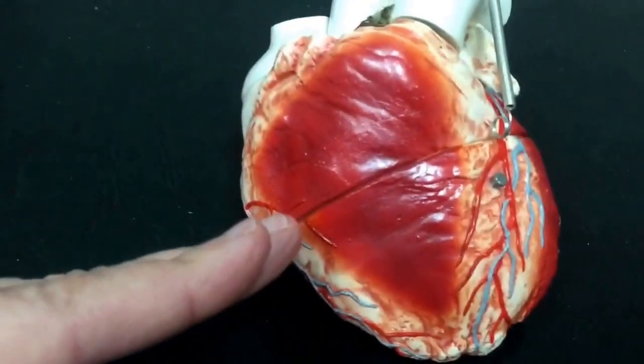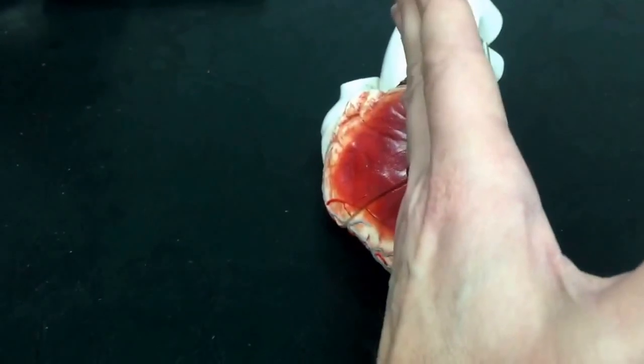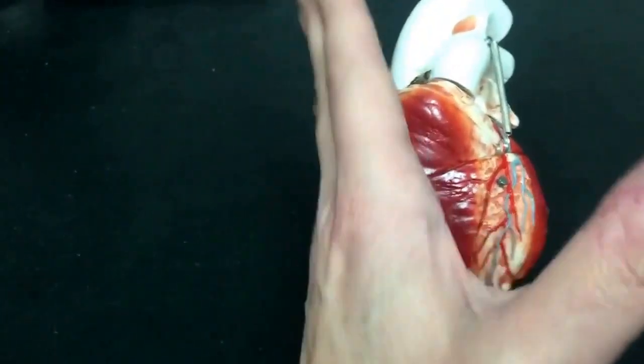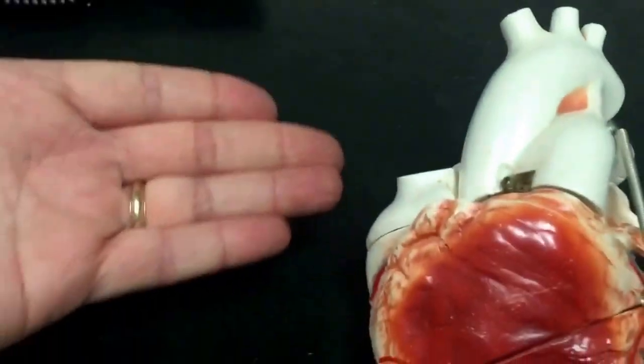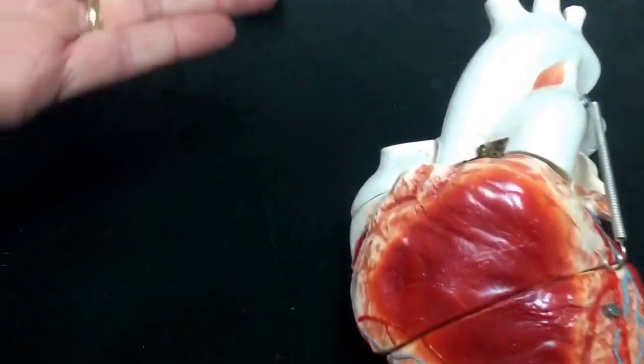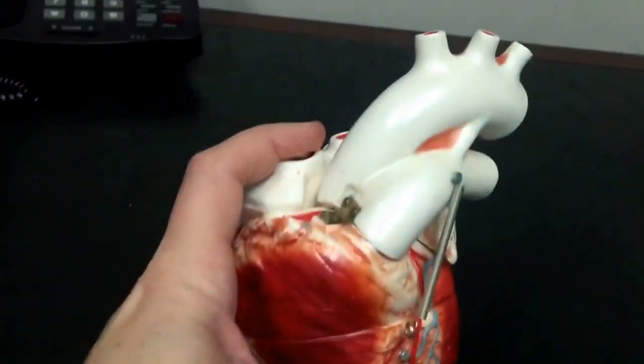So let's see, this would be a cross section. Cutting down a medial plane would be a sagittal section. So any slice along here would be sagittal. And anything cutting across this plane would be a coronal. I think I've got that right.